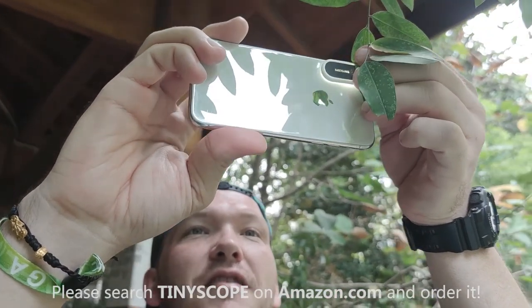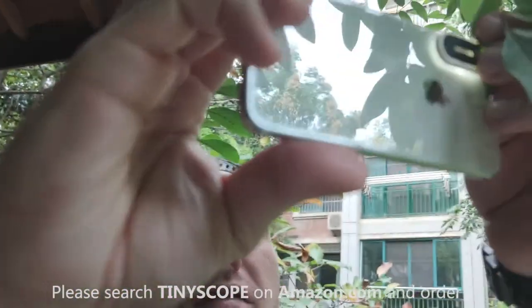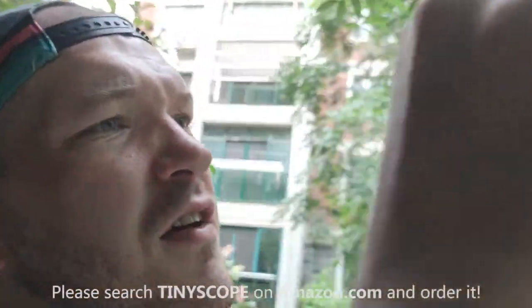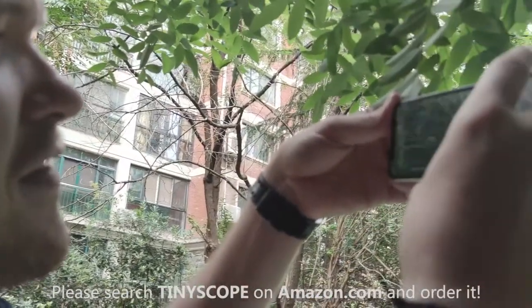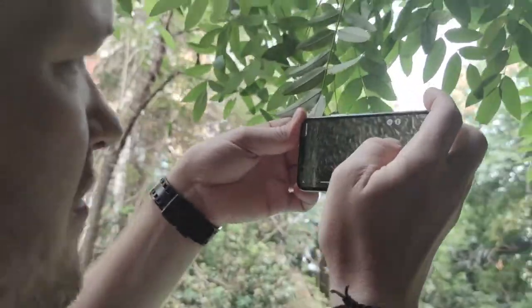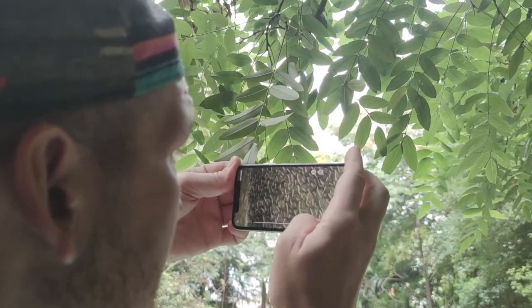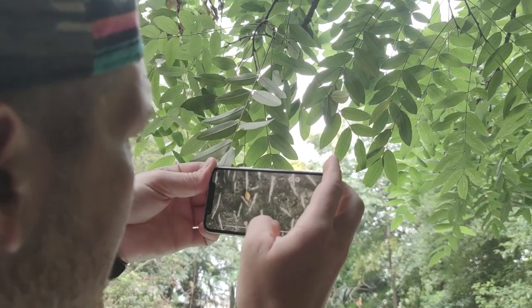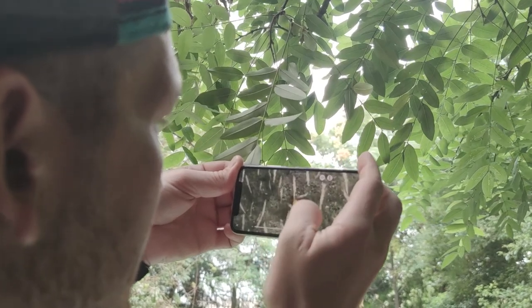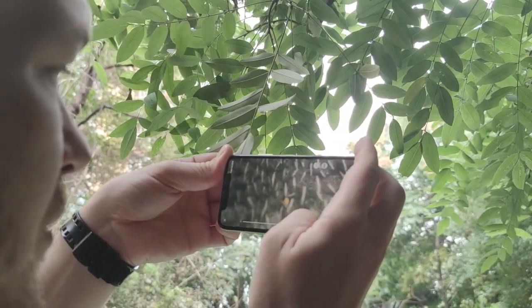It speaks for itself — it's so cool, it's super fun. Checking out everything you can see outside. Was that like a bug's egg? That's pretty wild. Super cool!